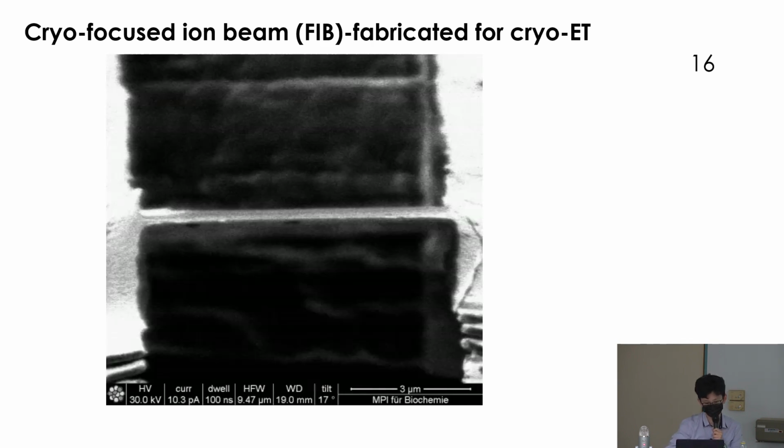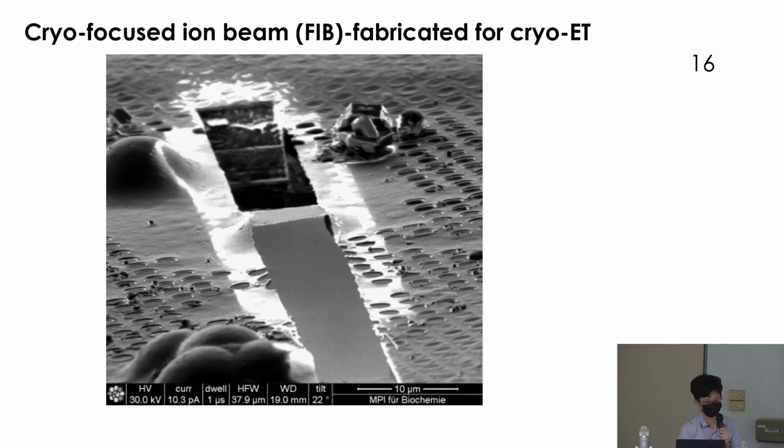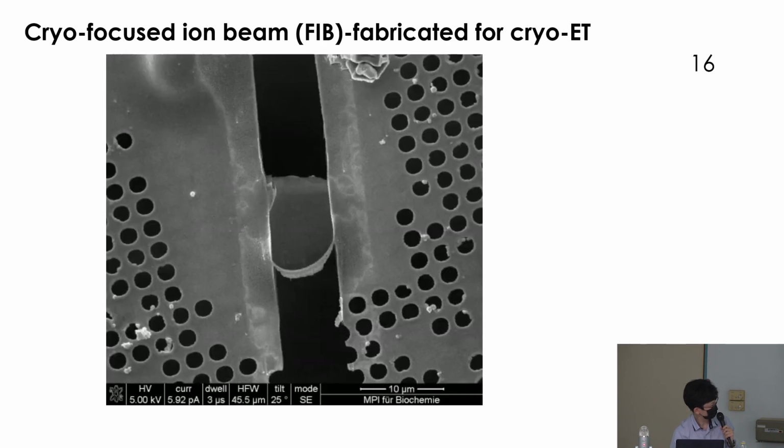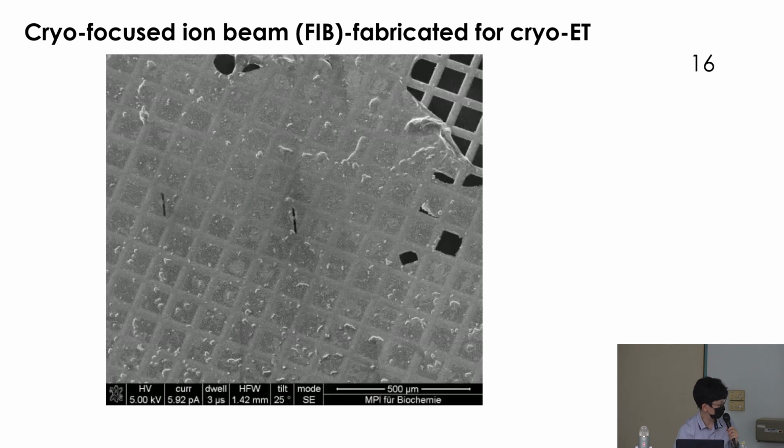Speed it up a little bit. So now you generate this one lamella. You can have several lamellae for you to observe in the microscope.